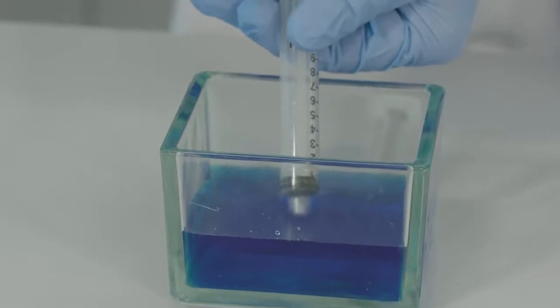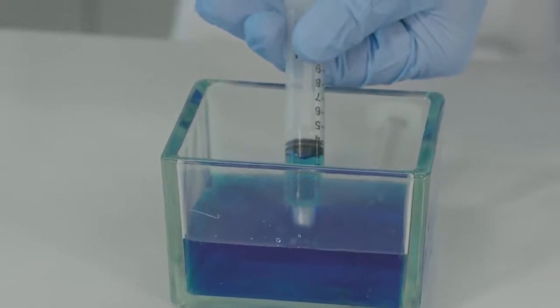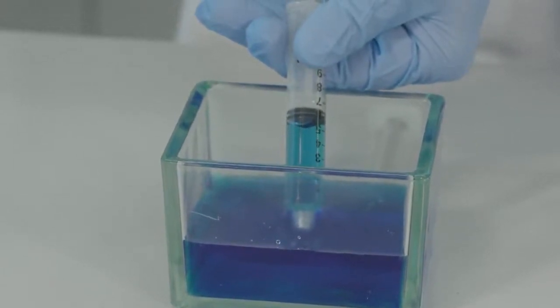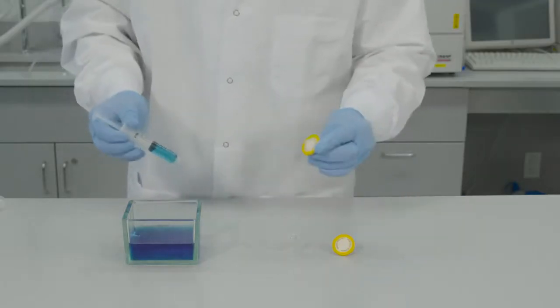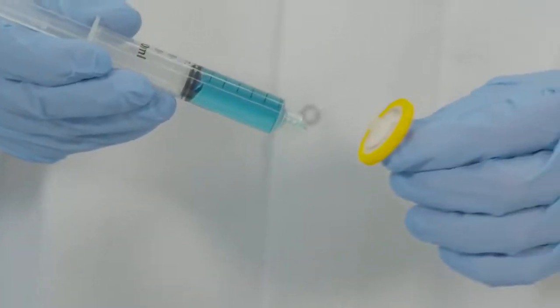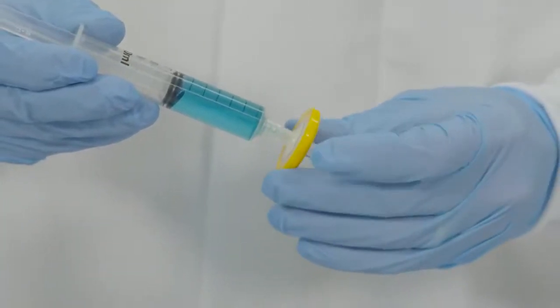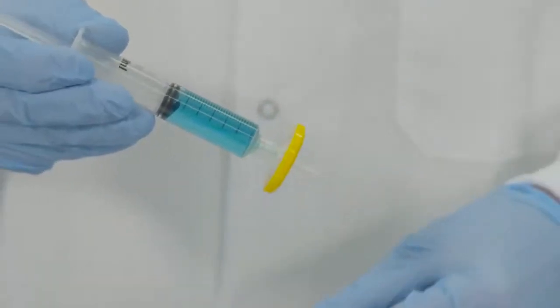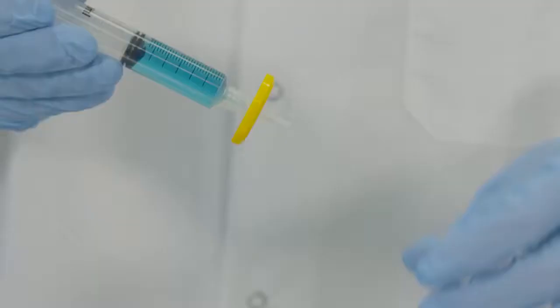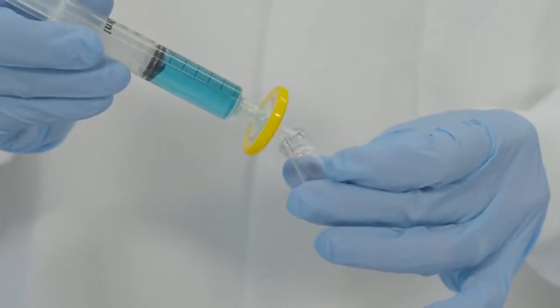pull liquid in a syringe, attach a syringe filter, and push the liquid through the syringe filter. Sample is filtered at this point.